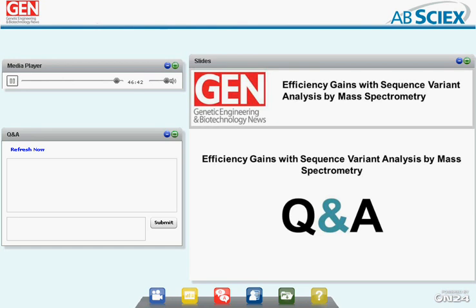Okay, Eric, thank you. And Stephen, will accurate intact protein mass help to speed up the identification of sequence variants and localization of the variants? That's quite an interesting question. I think a lot of people will assume that you can localize things at the intact level. Generally, this is regarded as impossible. The variations are so numerous that the ambiguity is quite high.